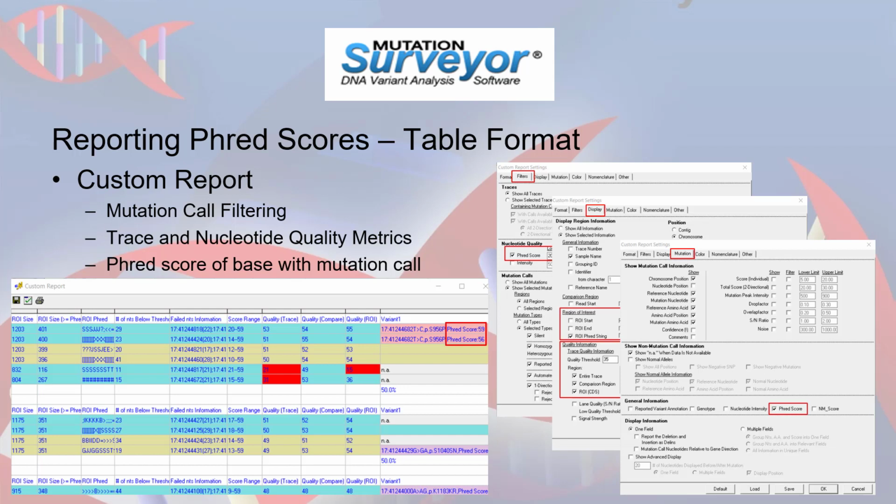To include the Phred scores of the base with a mutation call, click on the Mutation tab of the report settings and select the checkbox next to Phred score located in the General Information section.